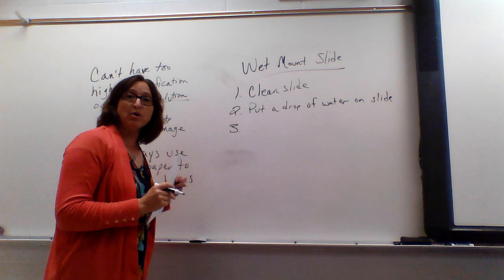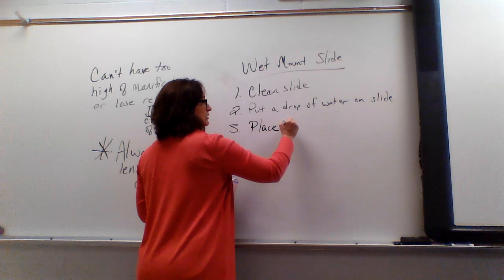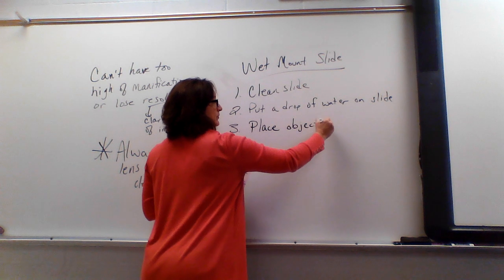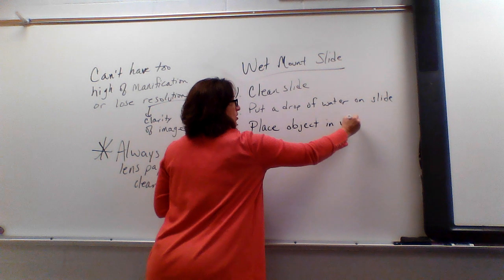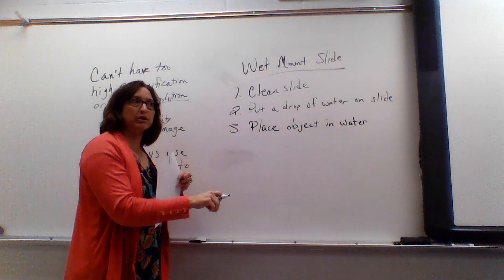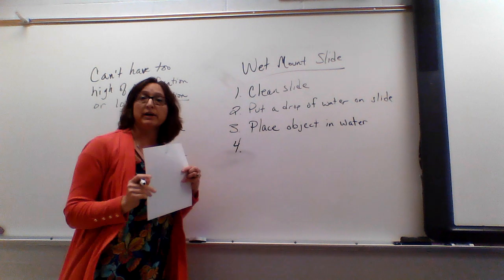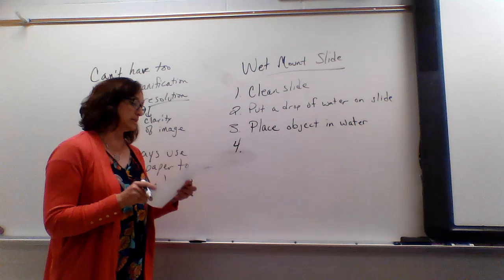After that, you're going to place the object that you want to view in the water. So water goes down first, object in the water. Sometimes we have to stir it up in the water, which we will do when we look at your cheek cells.